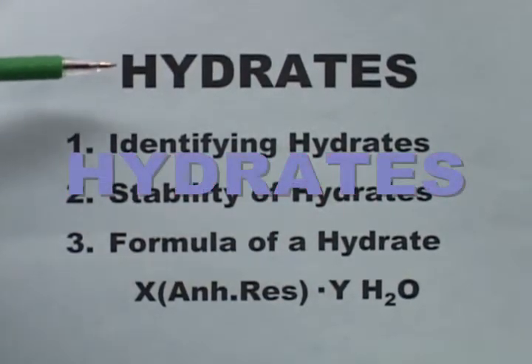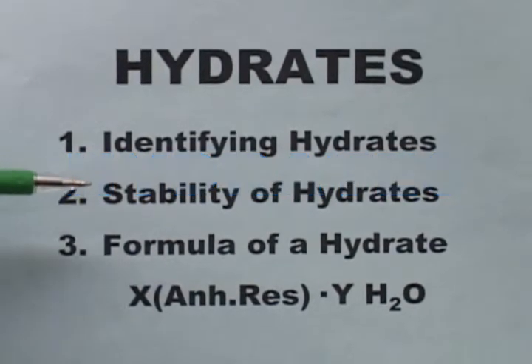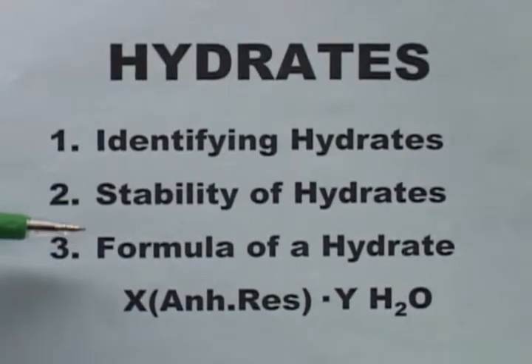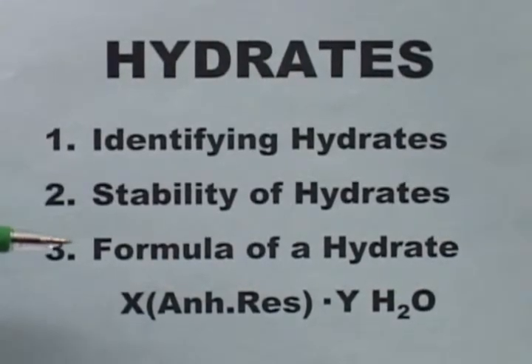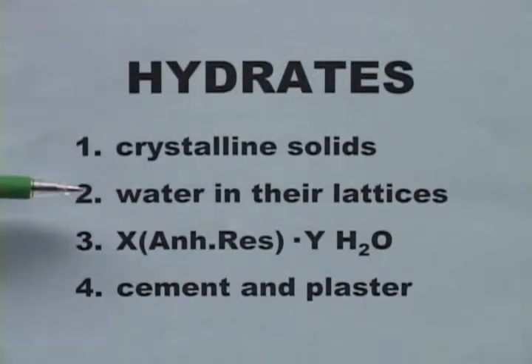Welcome to Hydrates. In this experiment, you'll learn how to identify hydrates, you will study the stability of hydrates, and you will also actually determine the formula of a hydrate. Now, in general, hydrates are crystalline solids which actually contain water molecules in their lattices. Not just the elements of water, but actual water molecules.